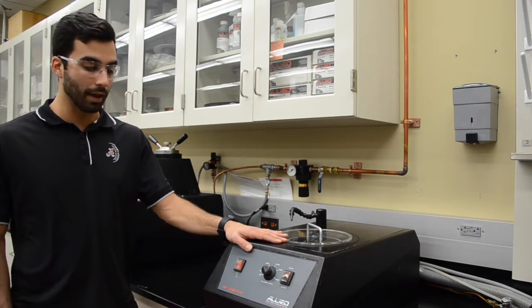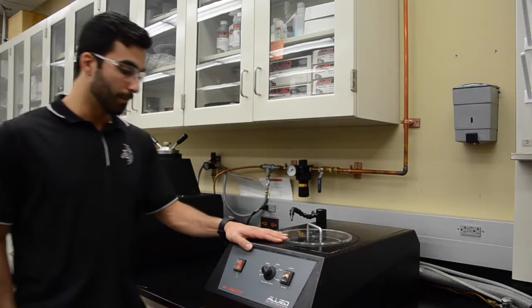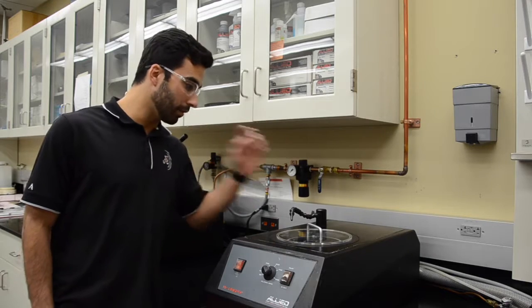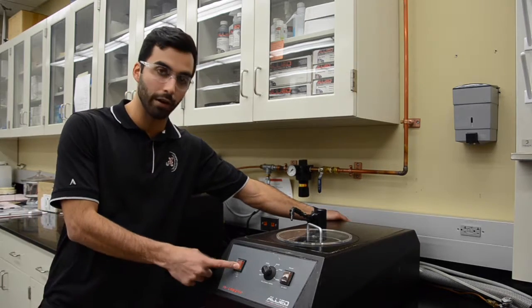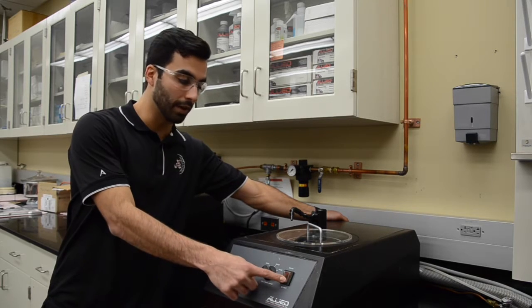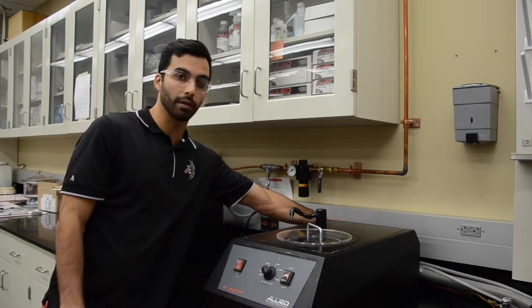For grinding and polishing, we're going to be using the Allied Hi-Tech M-Prep 3. Basically to turn on the machine, it's in a switch back here. Before turning it on, you want to make sure that the water is off and that the platen is not running. Once you make sure of that, you can go ahead and turn it on.